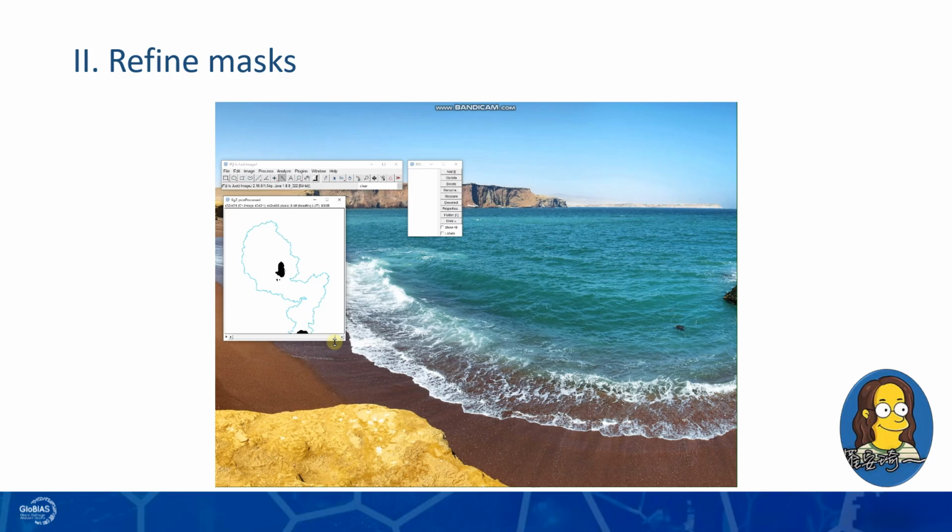Before setting the filter, we need to determine the area of the largest debris object. First, make sure that no ROI is selected on the mask stack. Then, open Analyze Particles. Set the size range from 0 to infinity. Choose Show Nothing and enable Exclude on Edges and Add to Manager. Run the analysis on the entire stack.